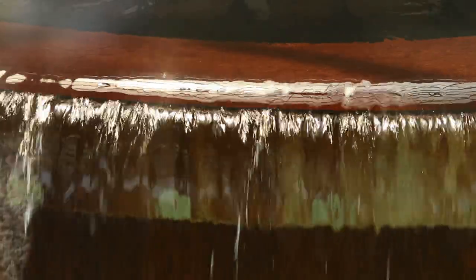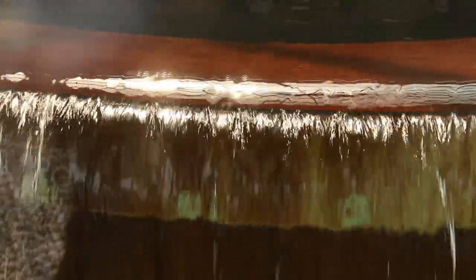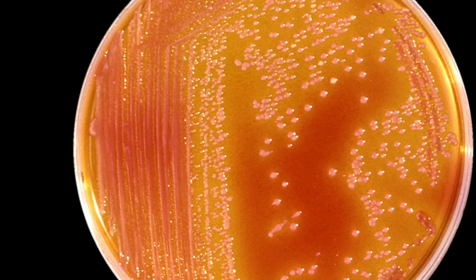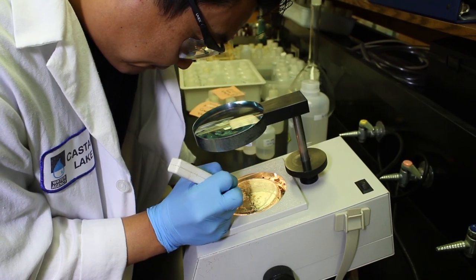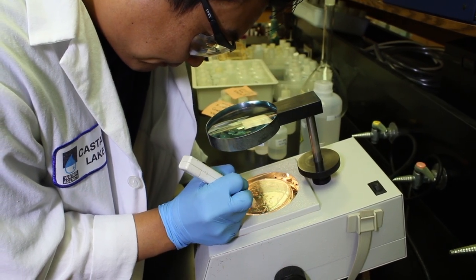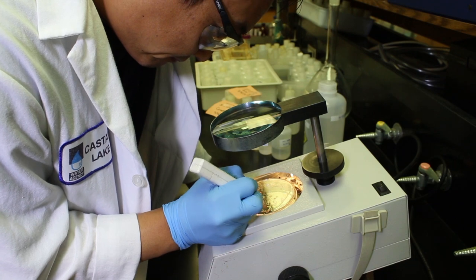To ensure the water is safe to drink, water utility companies screen for a variety of contaminants, such as coliform bacteria. While the concern is pathogenic microorganisms, the current-day technology does not enable us to measure these pathogens directly.